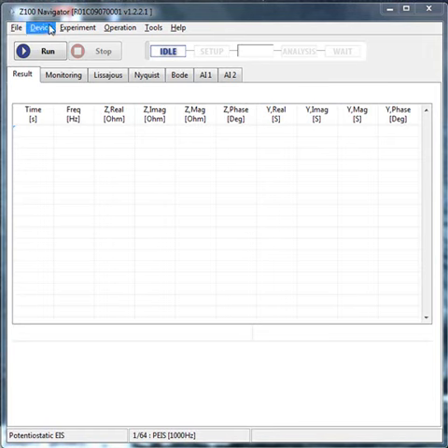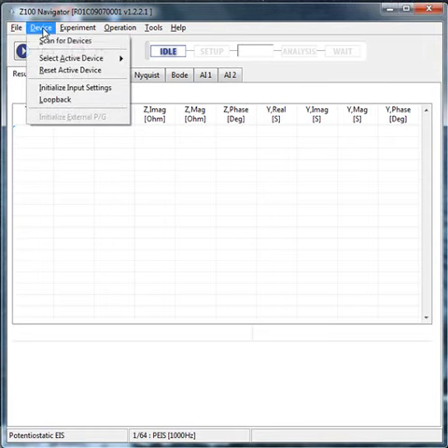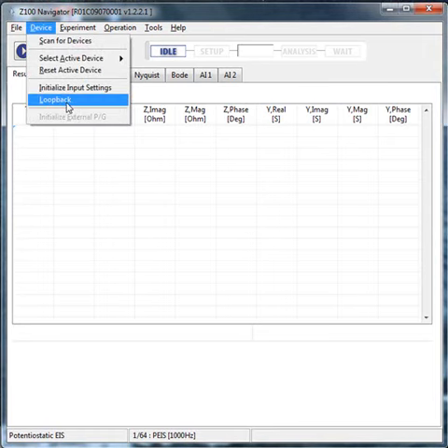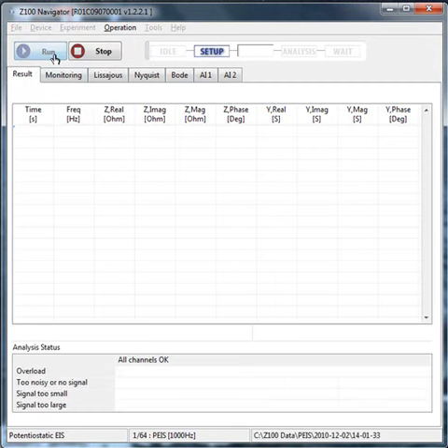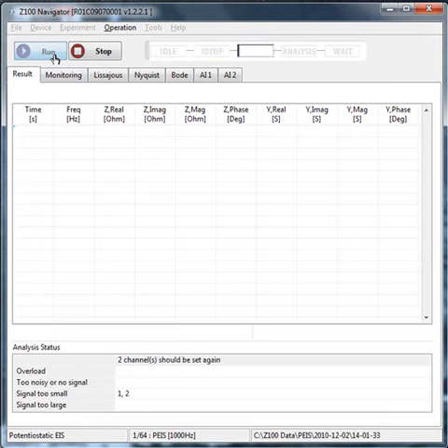To do the test, in the device menu, you should choose Loopback and then click on Run. The system performs a number of measurements to determine the appropriate internal gain levels. It produces an audible alarm when an unsuccessful trial measurement is made.